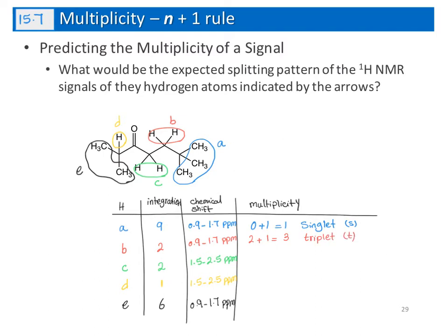for these protons. Now for the green protons, they are connected to the carbon. Again, we need to look at the neighboring carbons. This one doesn't have any proton. This one has 2 protons connected. So it should be again 2 plus 1. A triplet here.